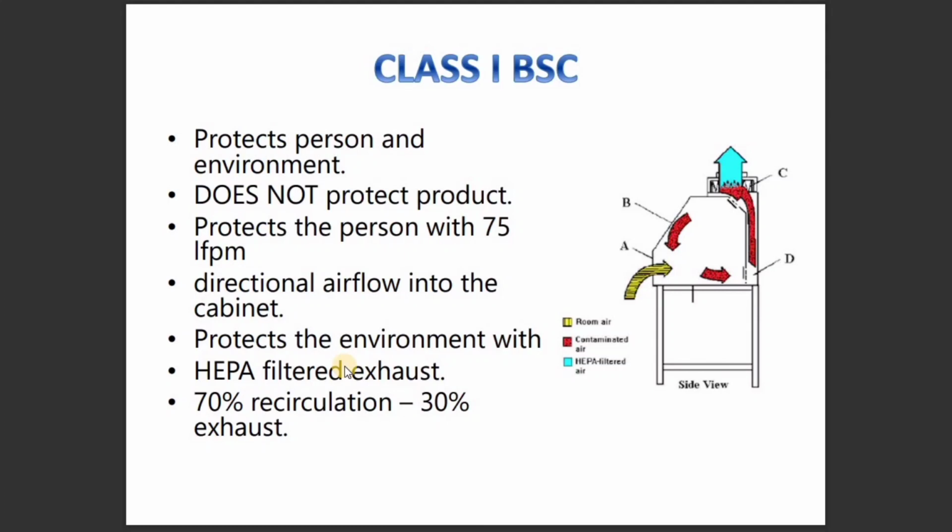Now biosafety cabinets. Biosafety cabinets are enclosed workspaces which provide personnel, environmental and product protection. The main principle is to protect the user from hazardous material using directional airflow.